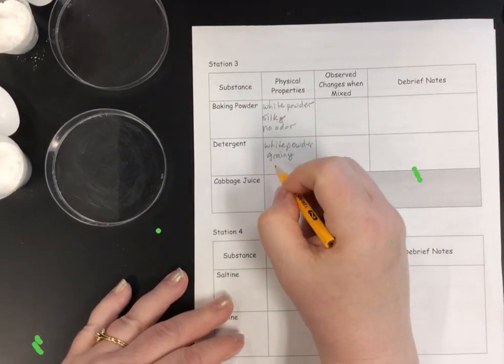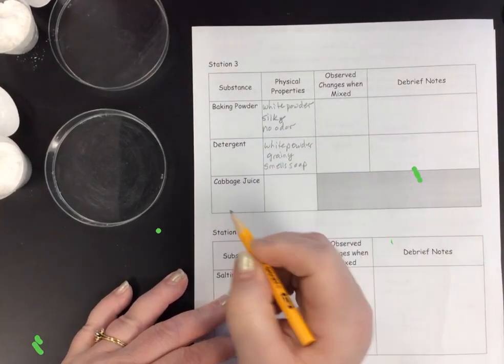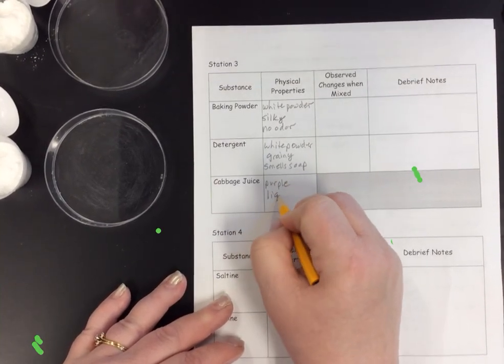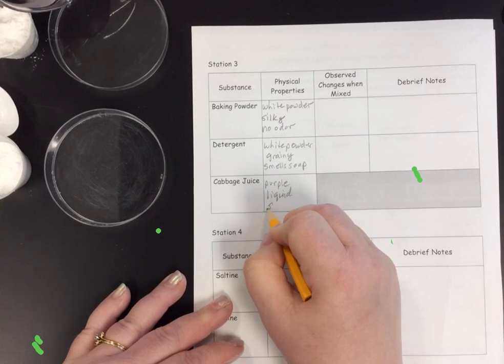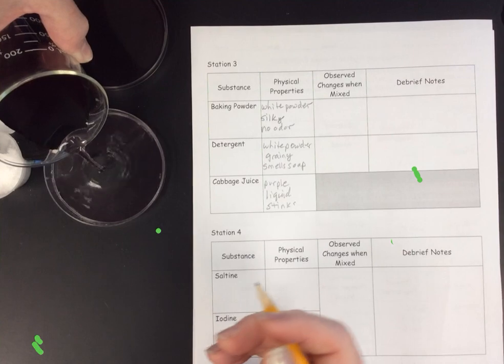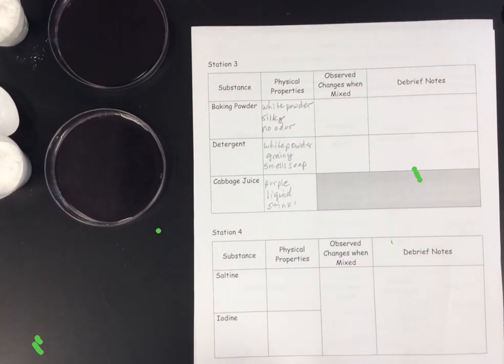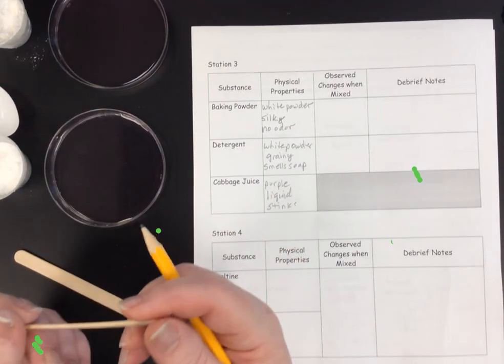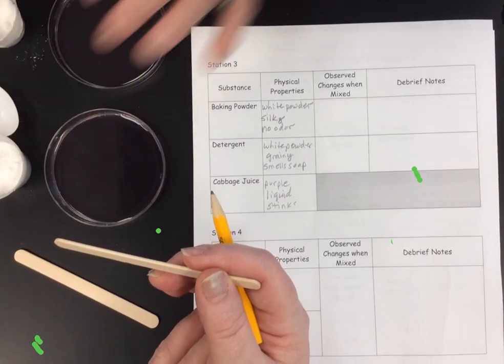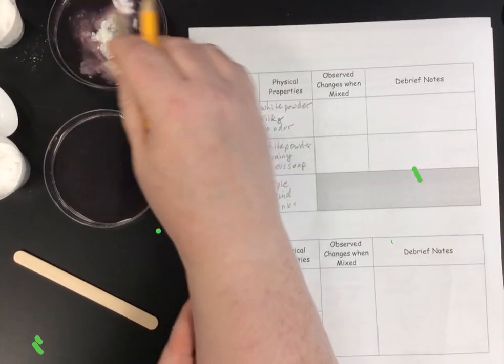We're going to use cabbage juice again, and you can use the same observations for it. It is purple, it's liquid, and it stinks. I am not measuring this, but we'll probably use about 30 milliliters in each Petri dish. What we're looking for is, does anything happen when I put half a spoonful of baking powder in this and stir it up?